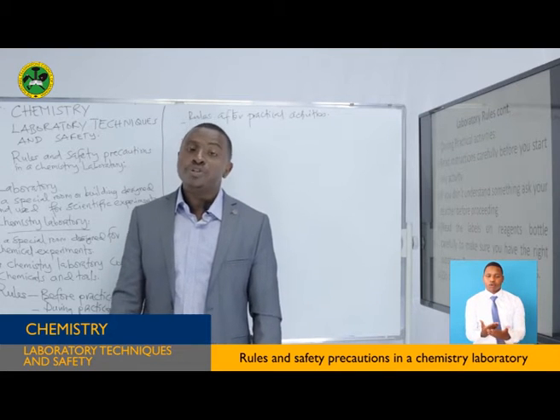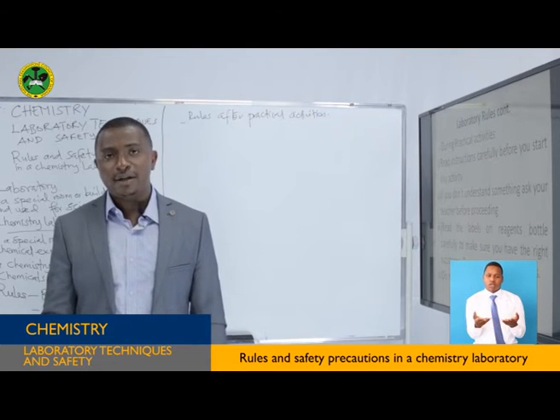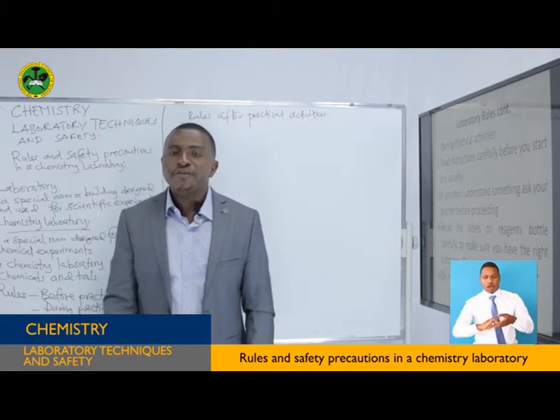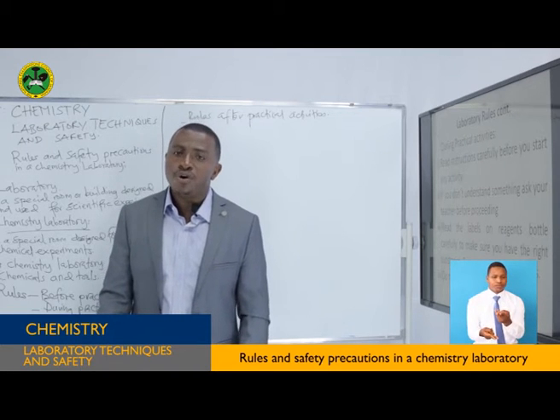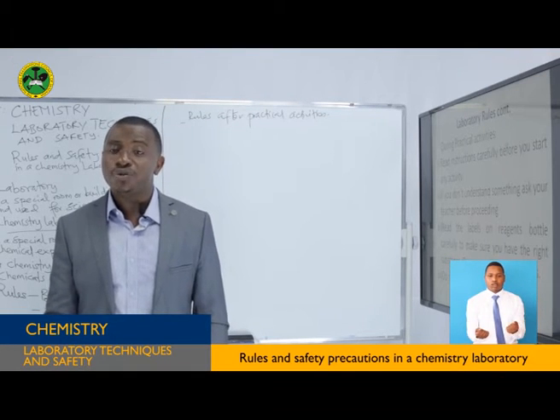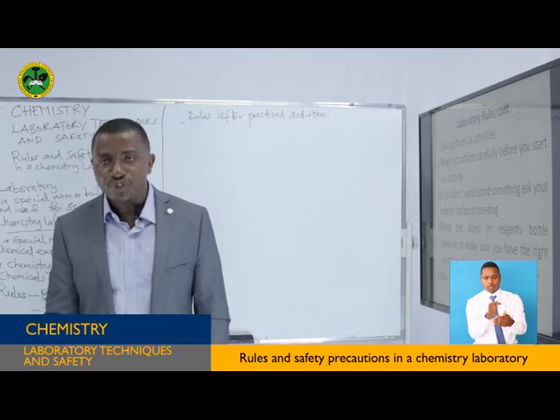It's because most of the lab chemicals look like they have the same color. Take an example of hydrochloric acid and water. They are both colorless. So if they are not labeled, it will lead to wrong use of a reagent, and will result in poor performance, and it can also lead to an accident. So you better label the reagent bottles that you are using.